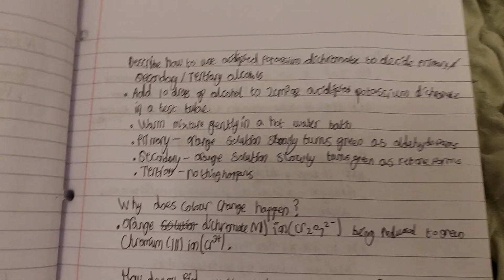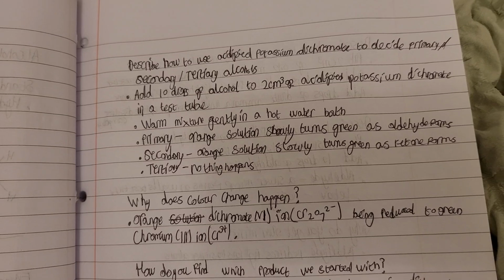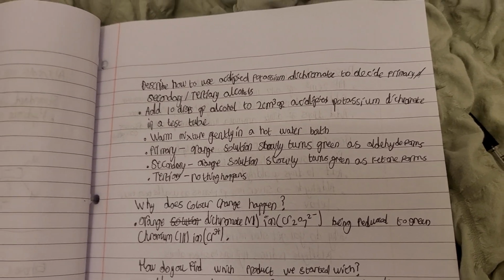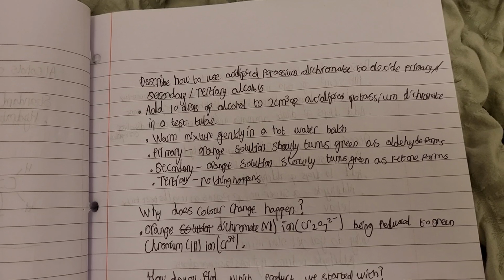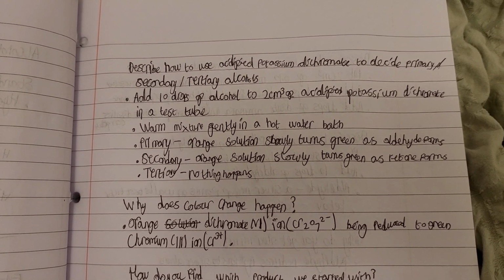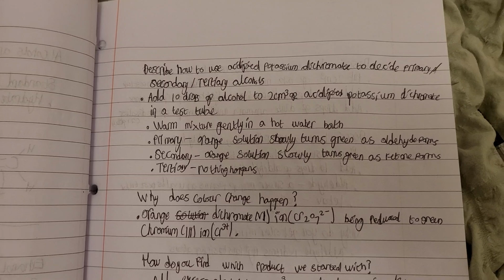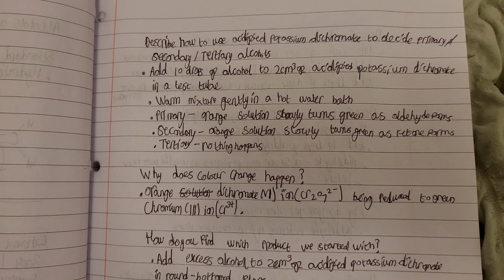So, practical skills. It's not really just one practical, it's multiple. It's really just tests to learn for primary, secondary, tertiary alcohols, aldehydes, ketones, carboxylic acids, all of that kind of stuff. So this is an organic analysis. Describe how to use acidified potassium dichromate to decide whether it's a primary, secondary, or tertiary alcohol.